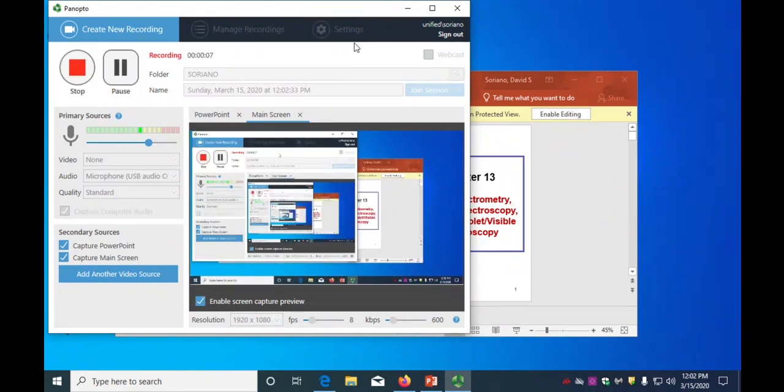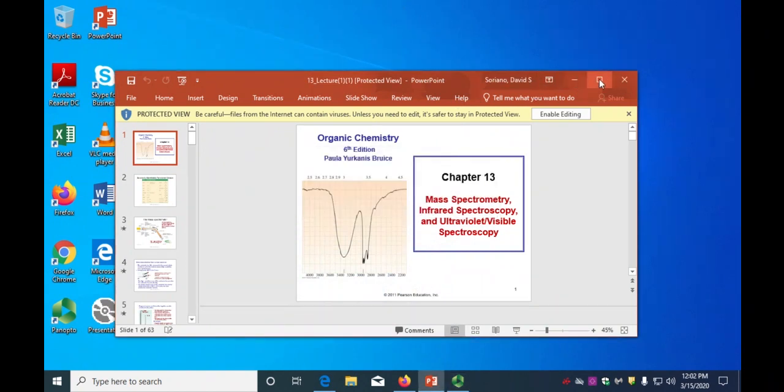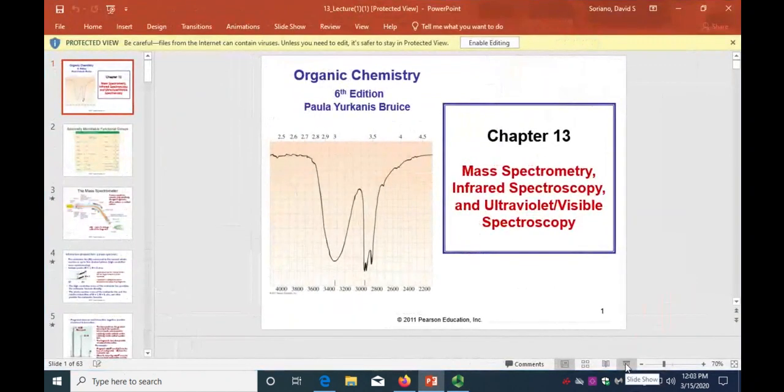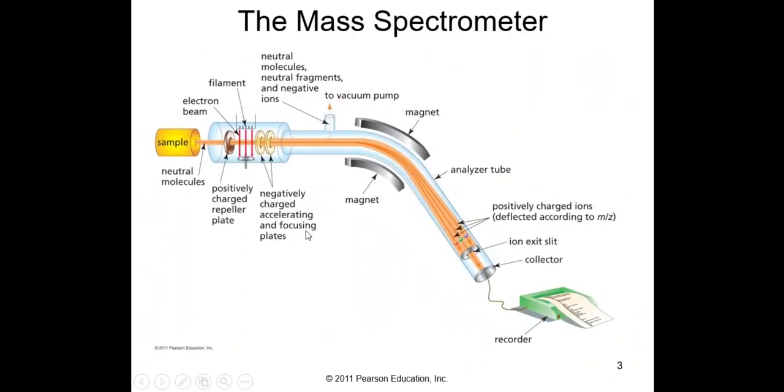Hello, everyone. Here's an introduction to fundamental aspects of mass spectrometry. Or a large screen, and we'll be underway. It's that easy. We've seen the infrared and a little bit of the UV-vis, so now we'll take a look at the mass spec.